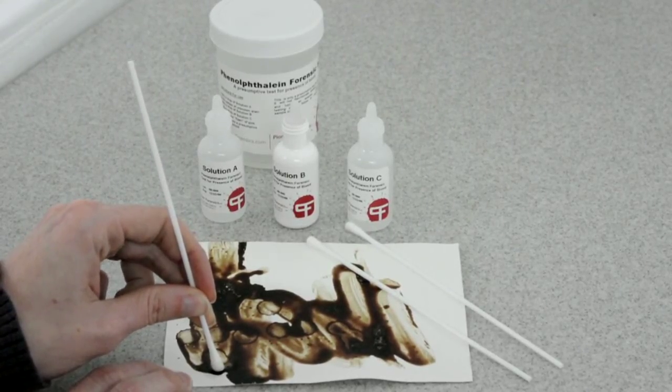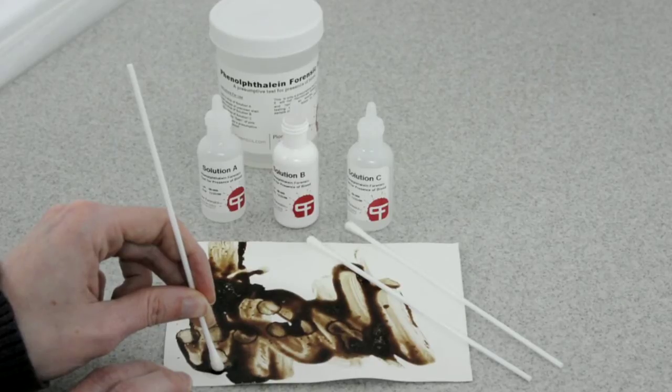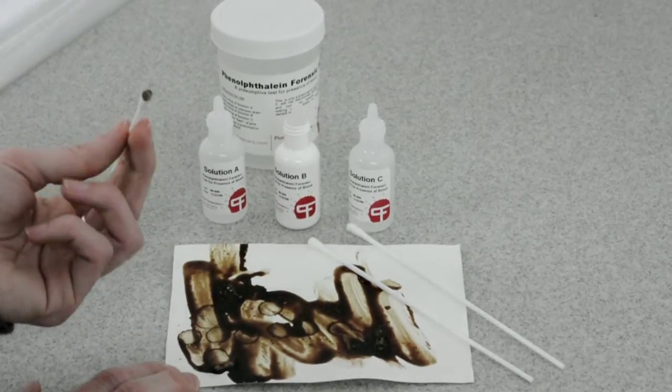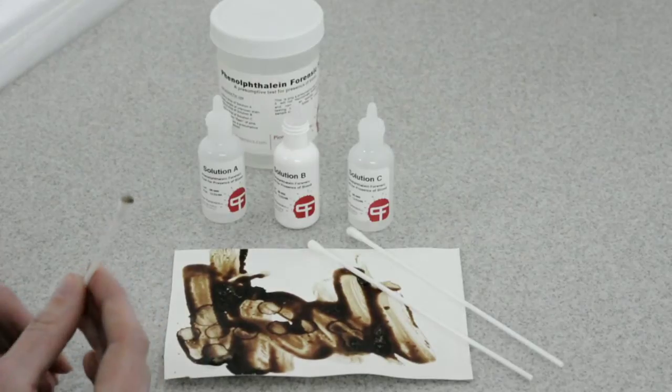you can skip Solution A, since you don't need to rehydrate — just take a small sample of your wet blood. Once you have your stain hydrated, be careful not to agitate the surface too much, because you'll draw a lot of contaminants into it.